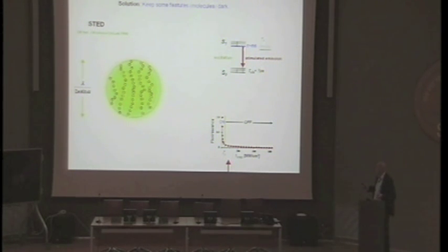But if the molecules are in the excited state, you can also just send them down by light, just as you can send them up. So there's no fundamental difference between sending molecules up or down. But if they are up, you can use a beam of light that just sends them down. In order to do that effectively, two conditions have to be fulfilled. First of all, the wavelength of that, say, down-sending light, it's called stimulating light, that's the technical term, has to be redshifted in wavelength. So it has to have lower photon energy, because it should not excite molecules, it should de-excite molecules. And since the photon energy is lower, of course, the molecules cannot be excited because the energy is not enough.